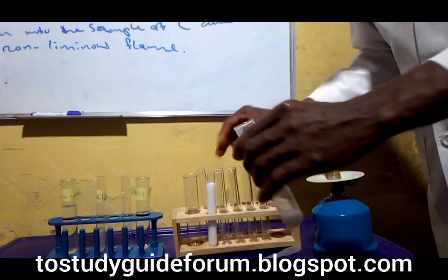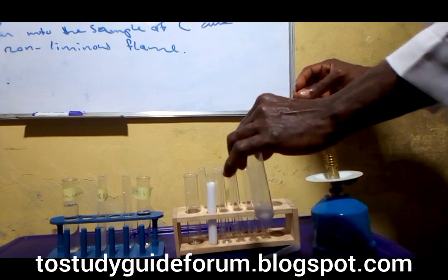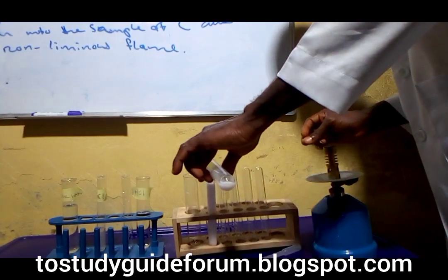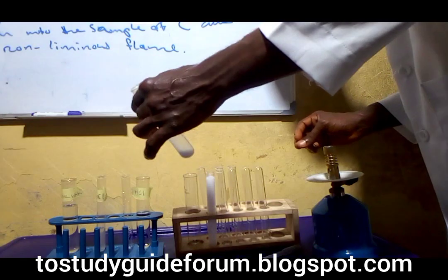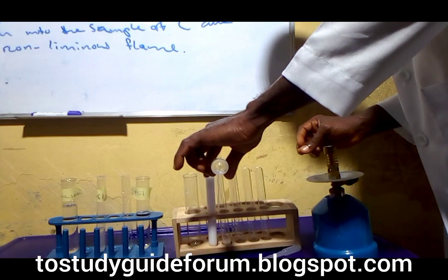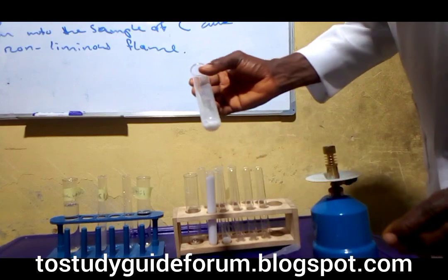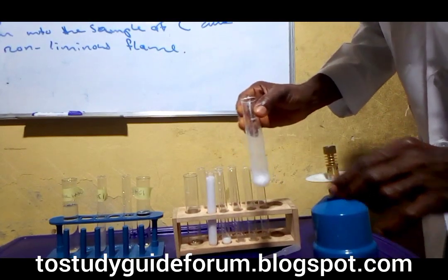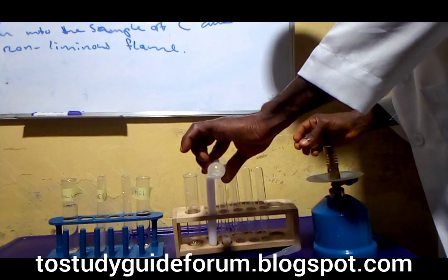So what we are doing now is to reduce the volume so that we can add dilute hydrochloric acid in excess, so that we'll be able to add enough excess to it. What we have here, we can make do with this one. I think we can make do with this. Let's just reduce a little bit for our reaction.